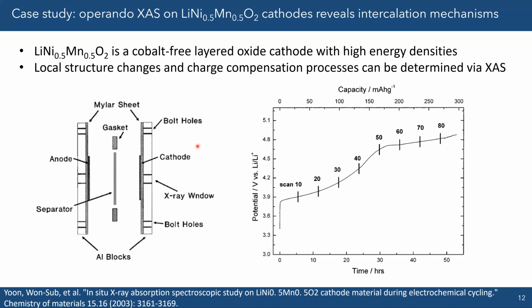For XAS, I know we just continuously charge and discharge it. It depends what you want, right? But if you're doing operando, you want to do it without holding it because you're trying to probe really what's going on as the device is running.